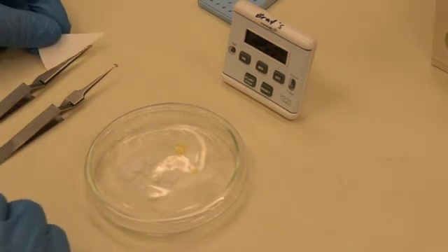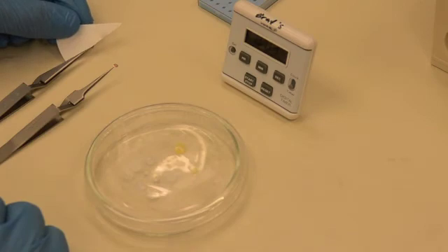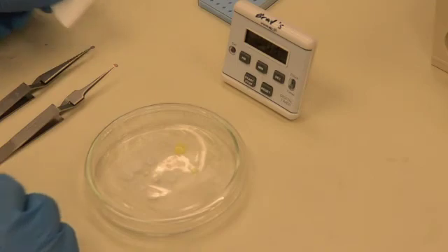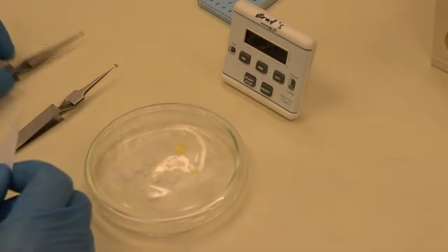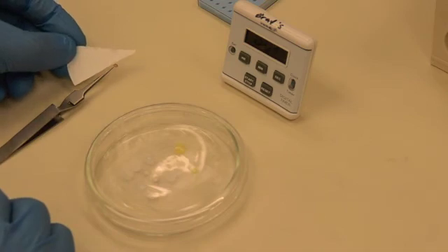Dry the grids by gently brushing a filter paper triangle alongside the grid, removing the excess water. Again, be careful not to rub the grid or push it off the forceps. Move the first sample out of the way so you don't knock it while you are drying the second sample.